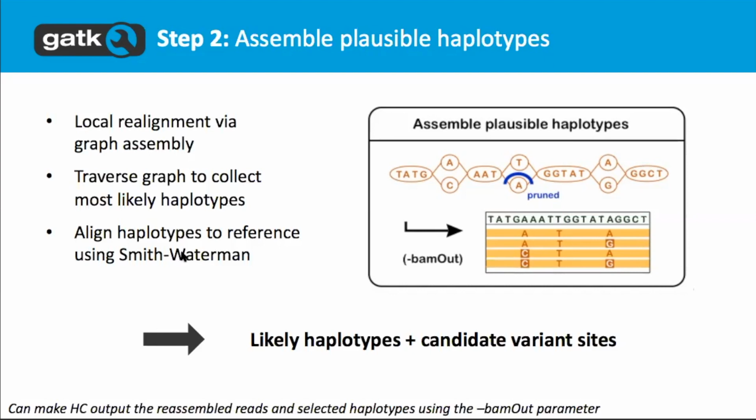And part of the reason is that the way they're scoring will penalize gaps, sometimes unfairly. So it's basically, if I have to insert a mismatch into the alignment, it's giving me a penalty. If I have to insert a gap in the alignment, it's giving me a bigger penalty.